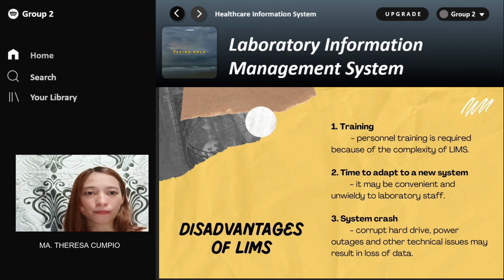The third and the last one is system crash. While the LIMS system is running, unrecoverable runtime errors may occur, causing the system to crash and return to the operating system level. Such runtime errors may be caused by the software itself, which should be corrected, or may be caused by the operating system.